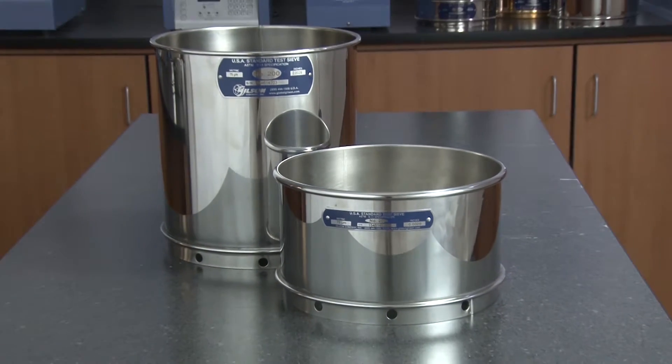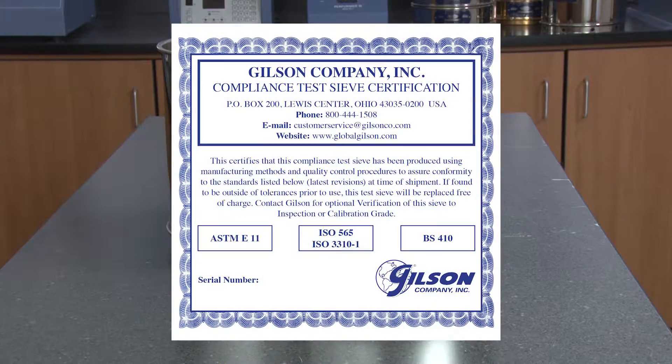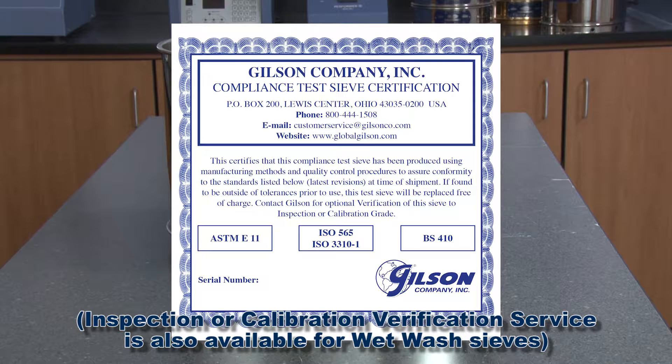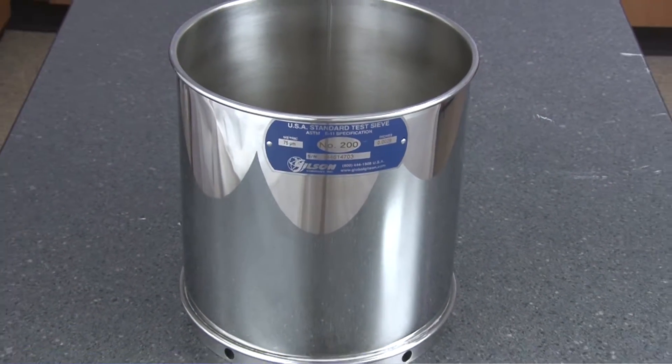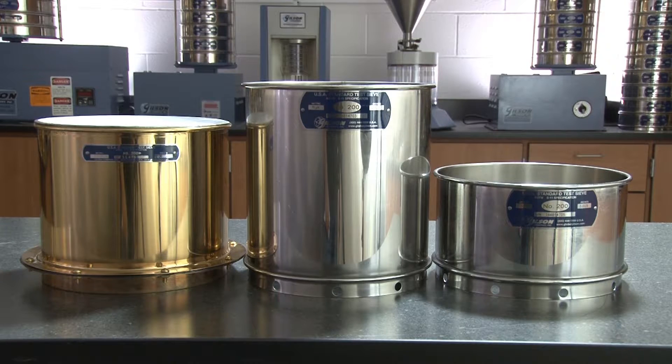Gilson's wet wash sieves are compliance grade sieves and come with a certificate of compliance to the appropriate standard. The stainless steel frames are more economical, offer better durability, and add a much longer service life when compared to brass frame models.